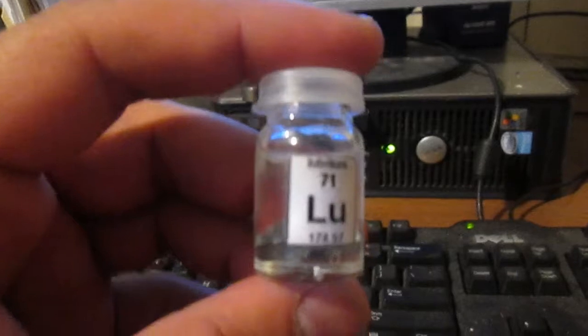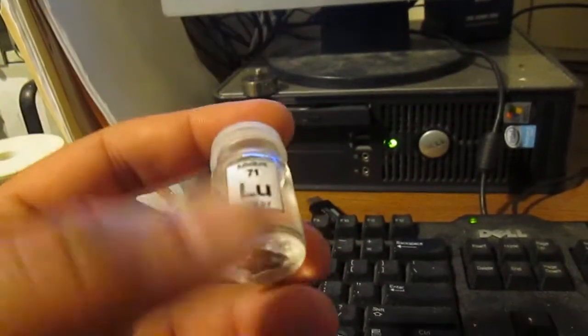It's a lanthanide. So we have a little sample here, a few grams. It's in mineral oil to prevent oxidation. It's a nice little shiny metal.